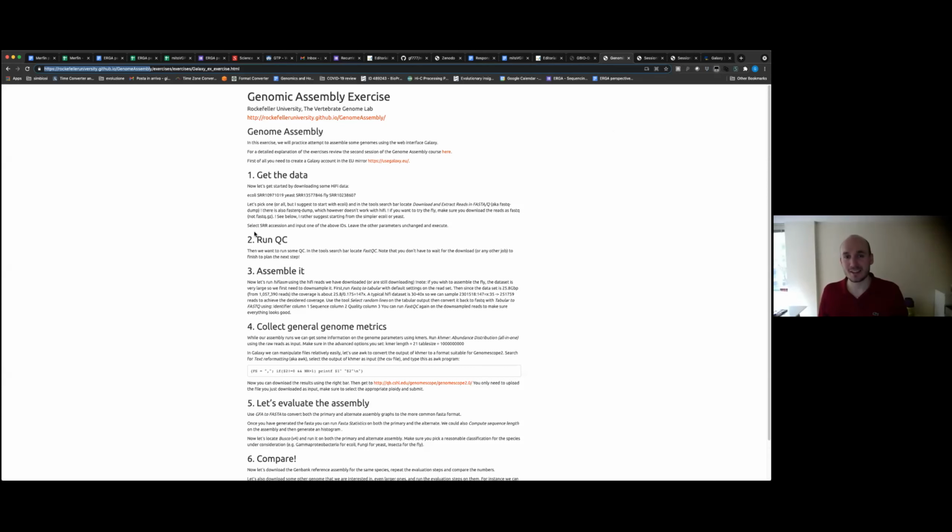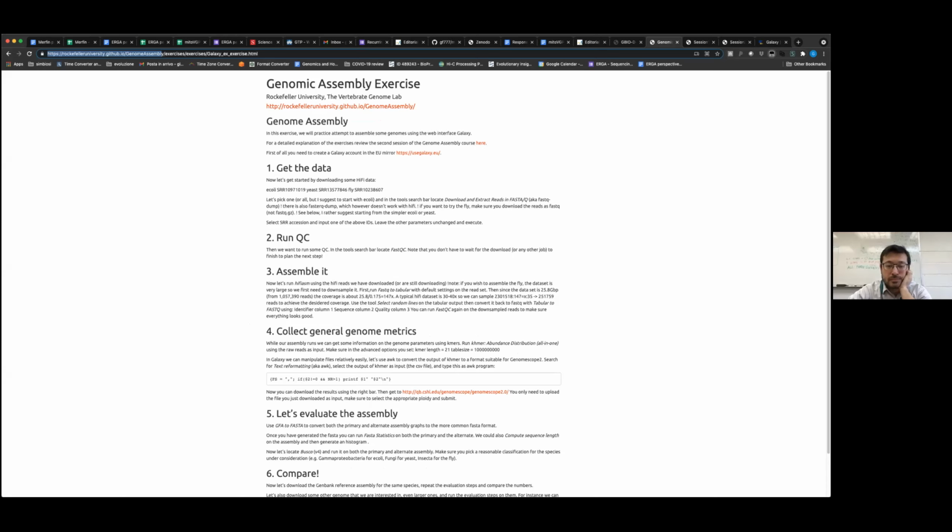So first of all, this is the exercise. I mean, Sadie, have you ever had the chance to try it? Yes, I had success all the way through almost to the end.